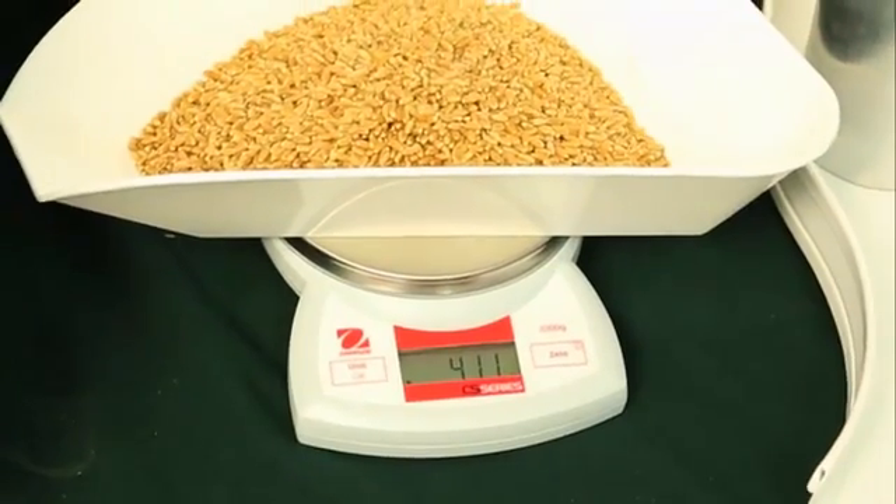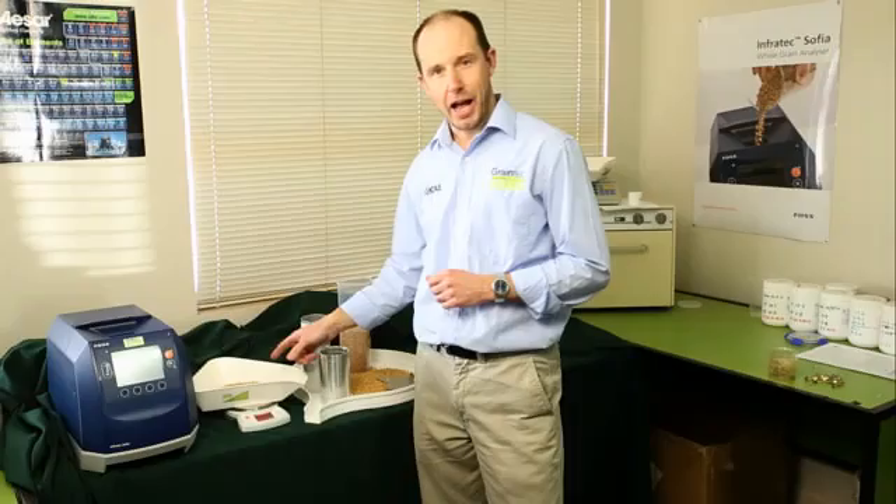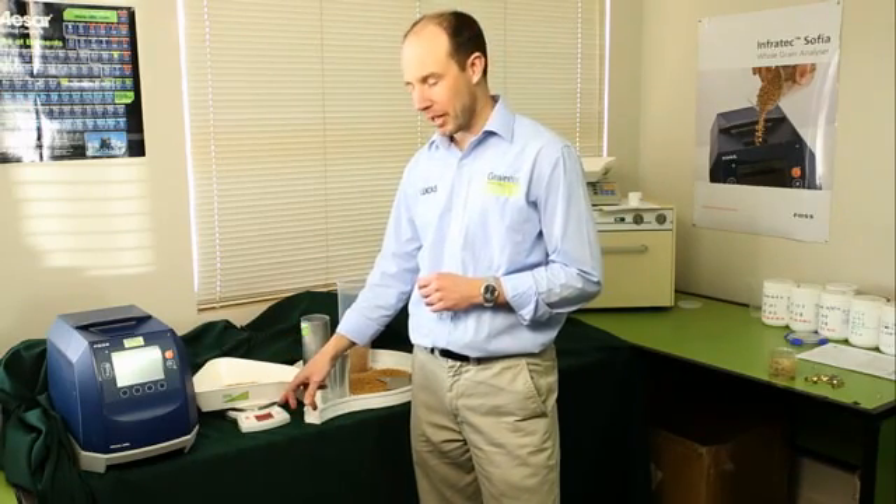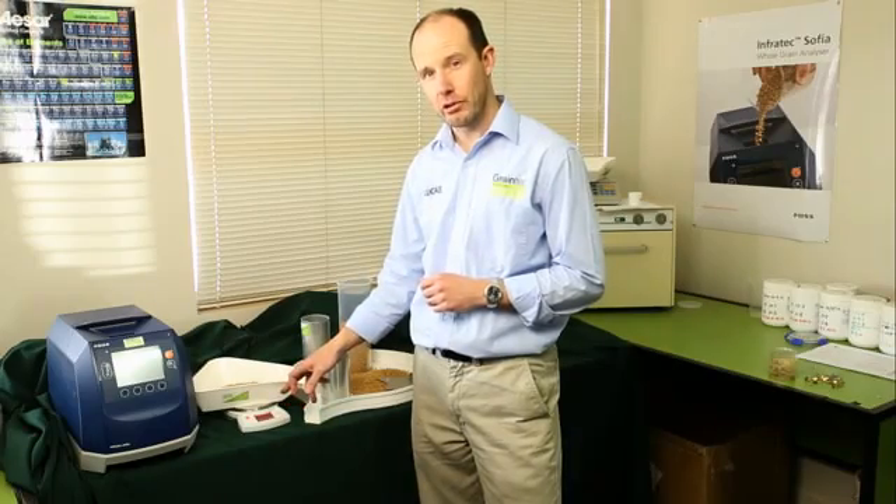After you've poured the grain sample into the container, take your reading from the balance. In this case, it's 411g.